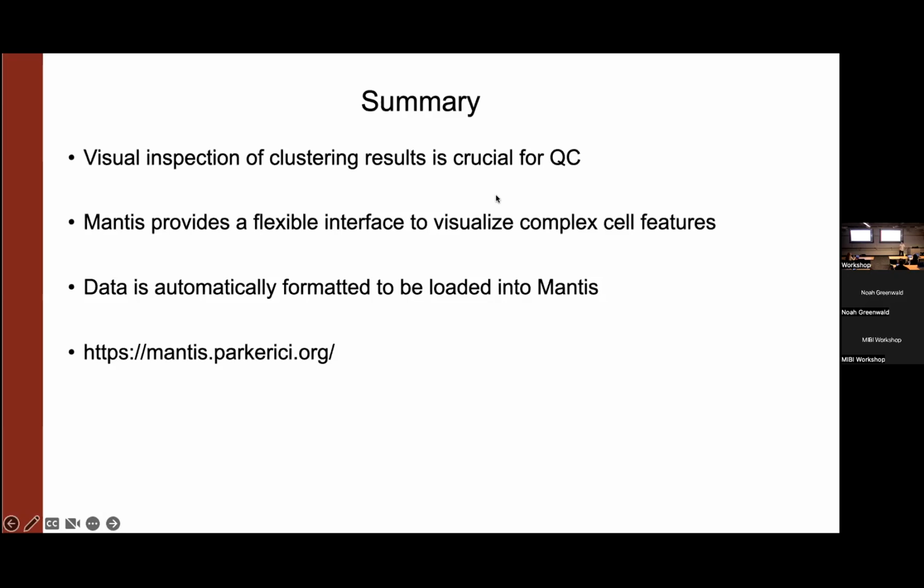So Mike's point was that the goal isn't to get to 100% accuracy. The goal is that you want to make sure the output of the algorithm is good enough for your downstream task, and what that means is no systematic errors. So you're not always classifying, when a FOXP3 cell is classified wrong, it's always a CD8. You want to make sure that the errors are fairly balanced, and that there's not a lot of them, but it does not need to get to 95 or 100% accuracy. For my data set, I found that around 90% seemed right on the first pass of Pixie.